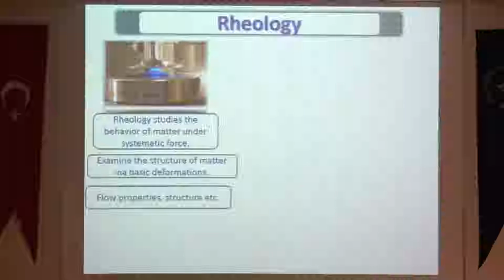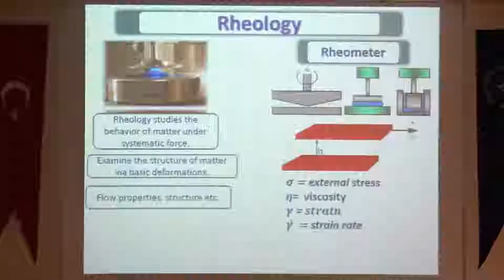You can measure flow properties, structures, etc. And in a commercial rheometer, you will have different types of load cells, and you can have either a fixed rotation or a fixed stress or force. So basically, this is just to remind people.